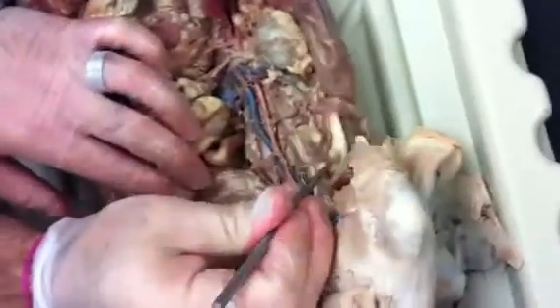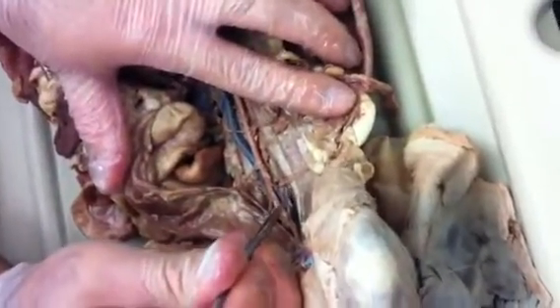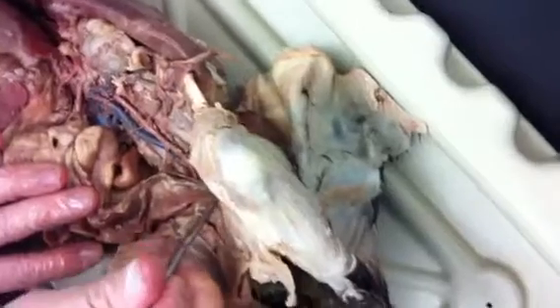Then we have some branching right here against the back body wall called the iliolumbar artery, and the vein usually right in with it. Lays on the back body wall. Then we branch inferiorly into the external iliacs and the internal iliac arteries. And then down here in the leg, we call this the femoral artery. And that's it for arteries. Probably no gonadal.